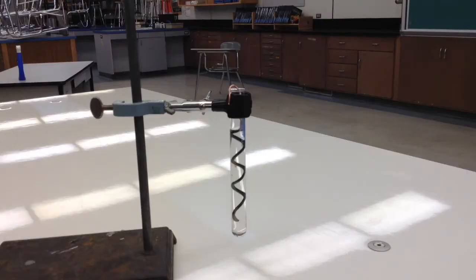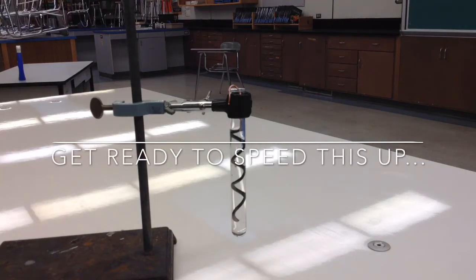At this point, our procedure tells us to allow the system to sit for about 20 minutes before doing anything else. So we're going to let this go for about 20 minutes before we begin to take it out of the solution. As you watch, feel free to record any observations that you see happening inside the test tube.